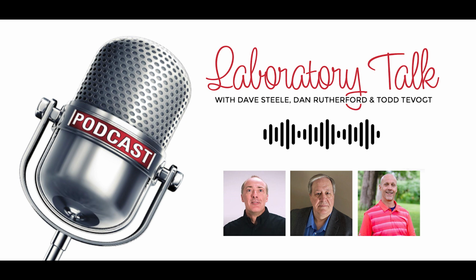So to be completely correct, we should really refer to vacuum as a partial vacuum because you can never really get to perfect vacuum. Yes, that is true. But as long as we all understand that that's what we really mean, we don't have to say partial vacuum all the time. I think it's okay to say vacuum. Makes sense. But is something like negative pressure, is that even useful?